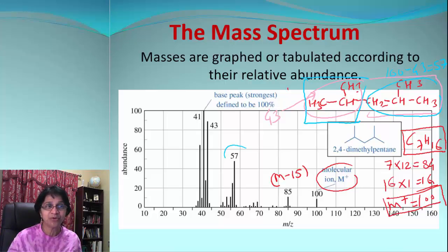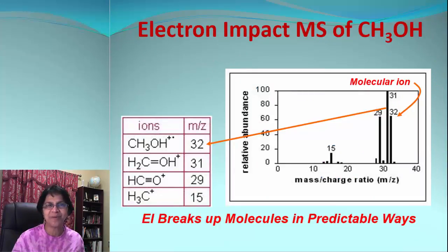Do we have both those products? Yes. That's again an indication that we got the exact molecular structure. So mass spectrometry is quite a powerful technique by which you can conclude if you have those groups in a particular order. Let's look at one more mass spectrum.